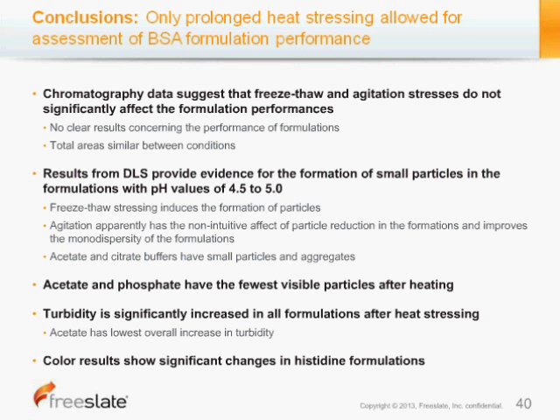We just don't see very much degradation, either from proteolysis or other degradation pathways that could lower the purity, nor do we see significant degradation in the realm of SEC, so we don't see aggregates, for instance, forming. As I mentioned before, the total areas are similar between conditions, which suggests that there isn't anything funny going on with the chromatography, or something else happening with the protein that we just can't see.